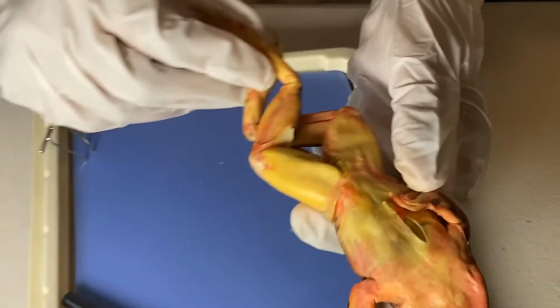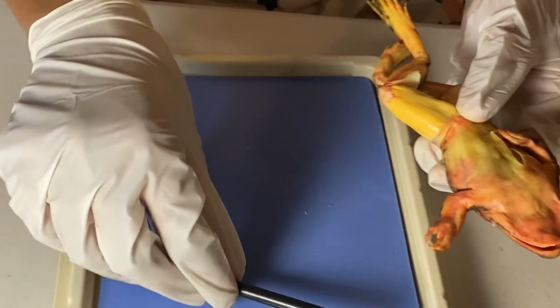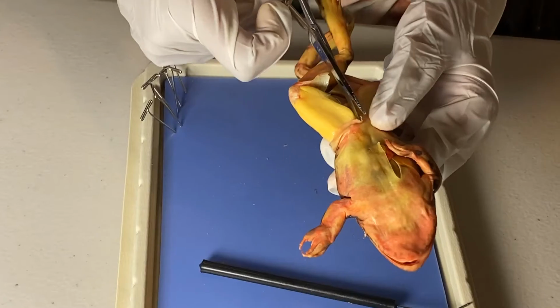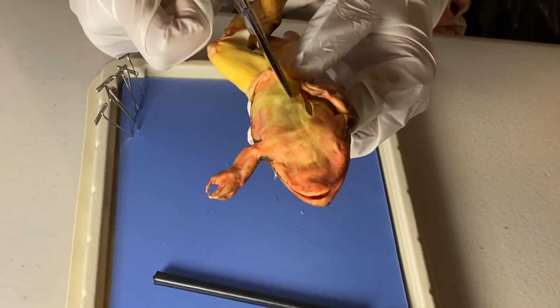Okay, so now I'm going to begin the dissection and start cutting. So first I'm going to take the skin off.